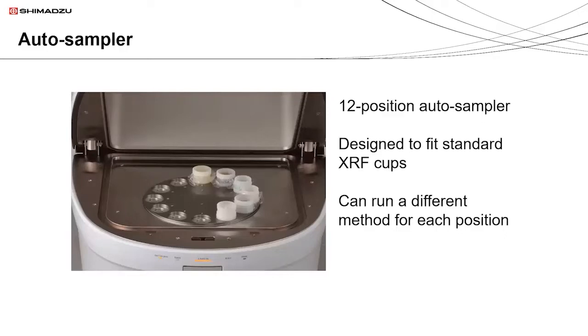For example, you might put multiple samples in there where for one set of samples, the target elements might be catalyst-like elements like palladium and platinum, where another sample might be more, the target elements might be the big four like arsenic and lead. So you do not have to come to the instrument if you need to run a different target element method.